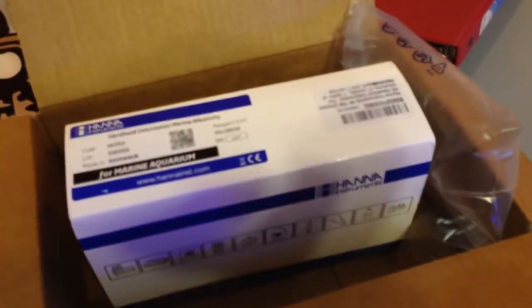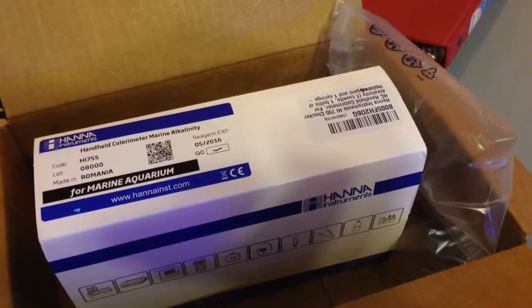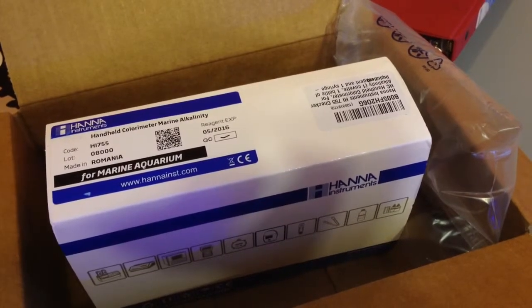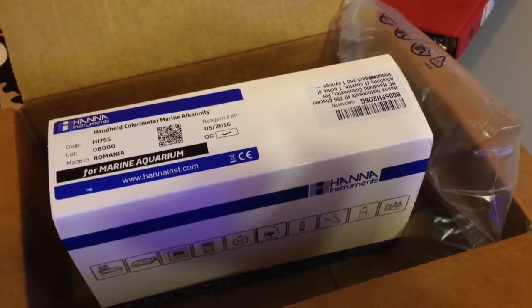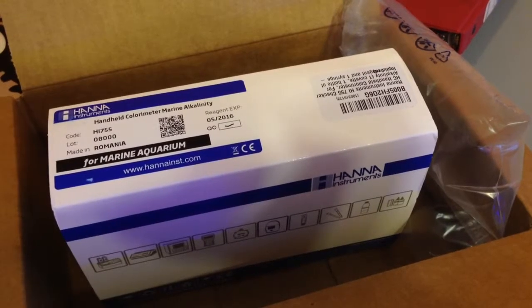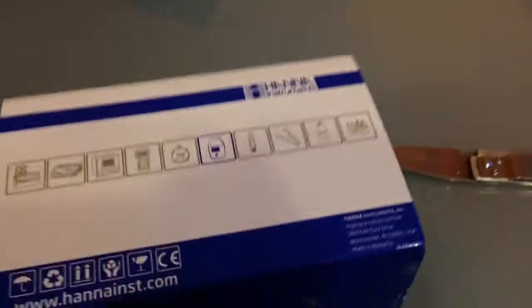So $41 for the alkalinity one. The other one I got was calcium — both require titration. That one should be $45. I saw the calcium on Amazon at $48 at the cheapest, but the shipping just wasn't going through, so I cancelled the order, got my money back, and bought the one from eBay.